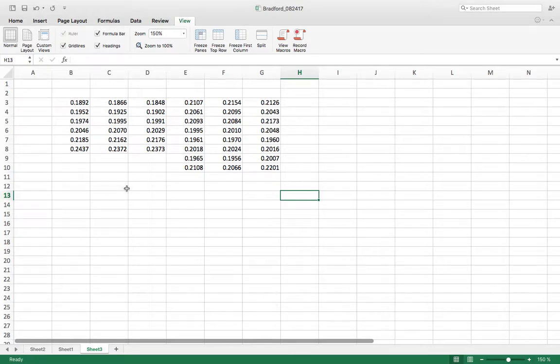But for the purposes of this day's lab, I'm just going to go through an example with some of my data and show you how on Excel to do this conversion. There is a way in your book that's also easy enough if you want to study it that way. I'm going to go through how I do a Bradford assay, and you can use this same technique if you're able to bring a small computer or tablet that you're comfortable using Excel with. I think it makes it a lot easier.